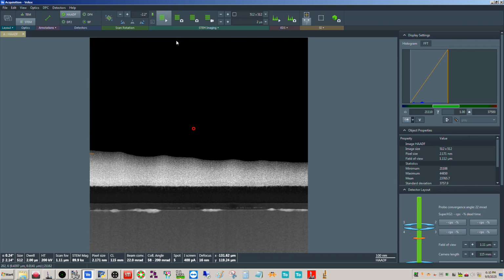All right, everyone, I'm back at you with another quick hitter video here, just doing optimization of your STEM detector gain and offset here. So there's a couple ways you can do this, and I'm going to show you both of these ways here.